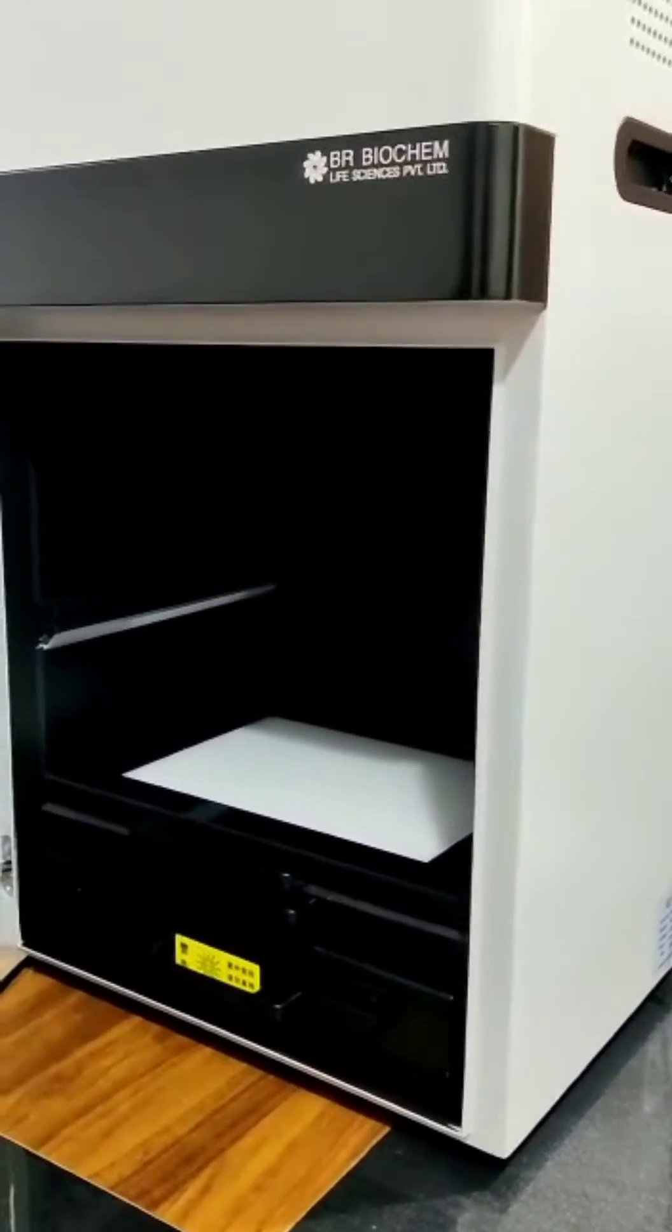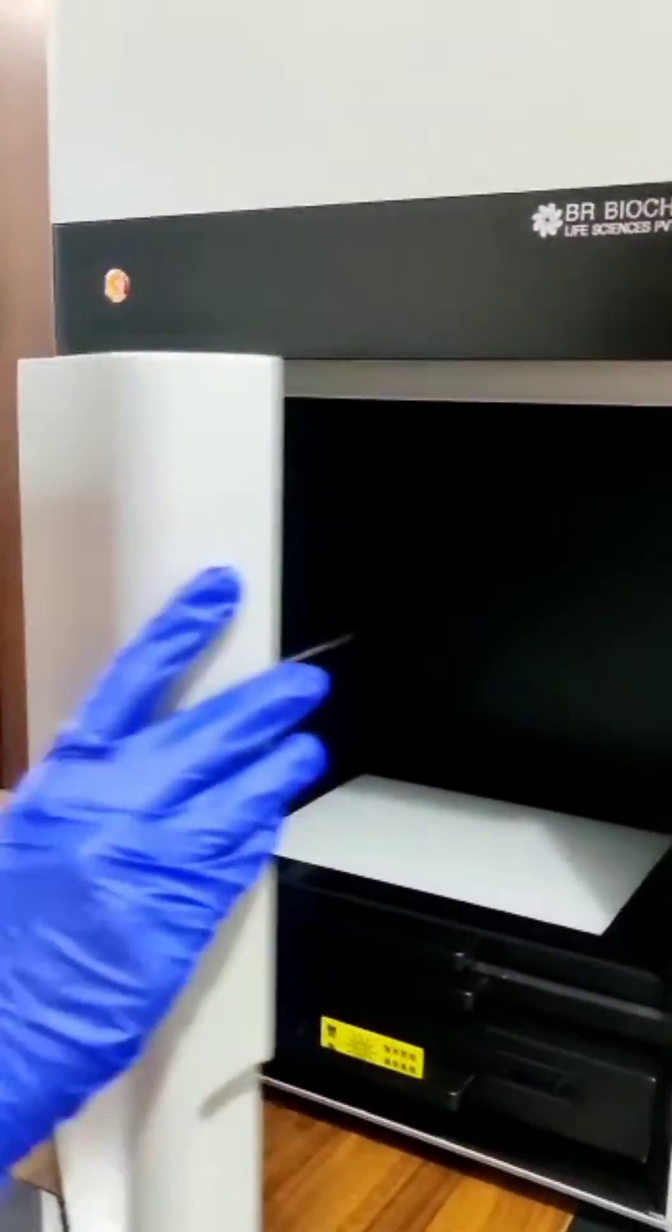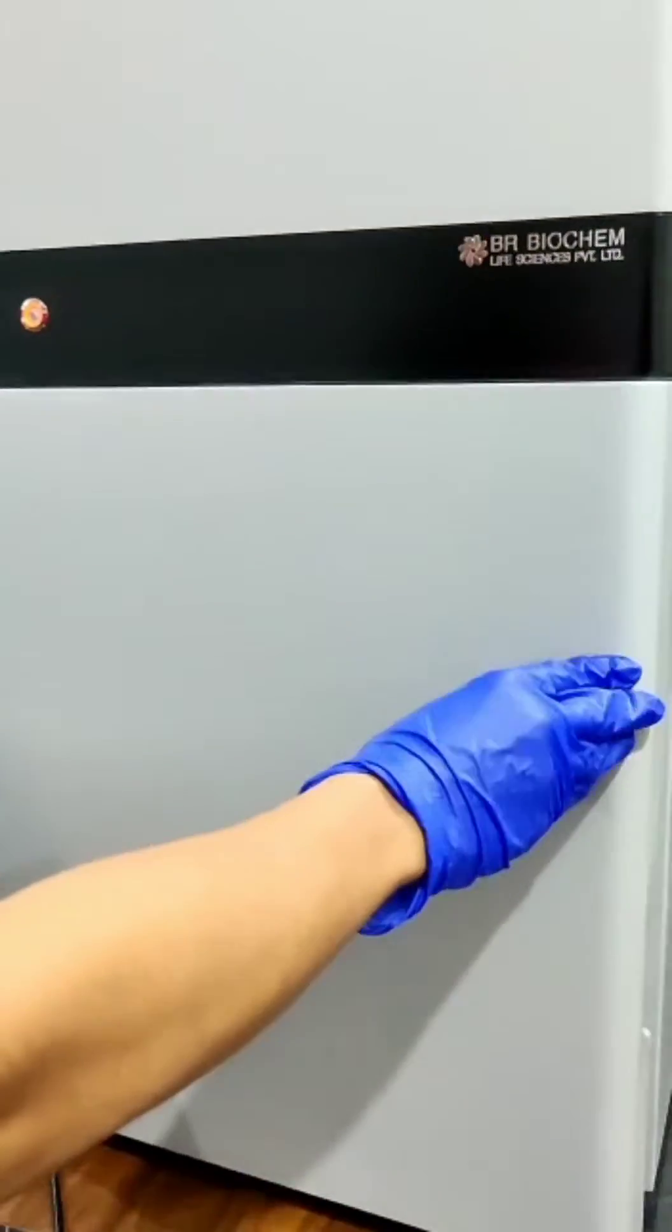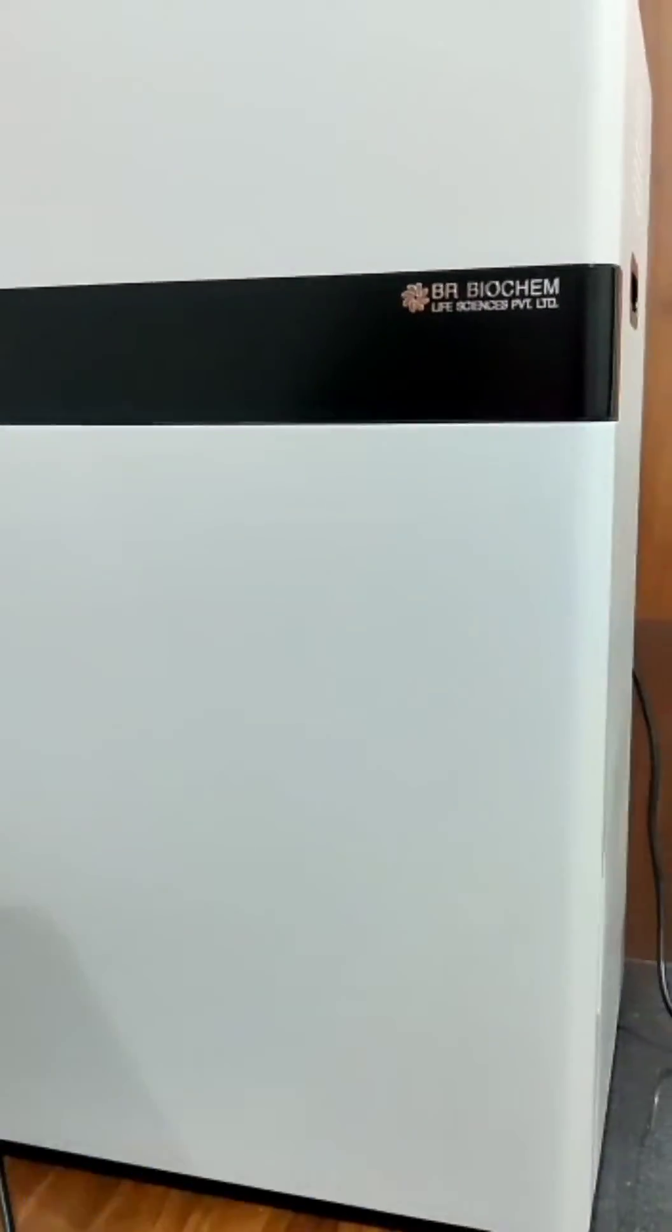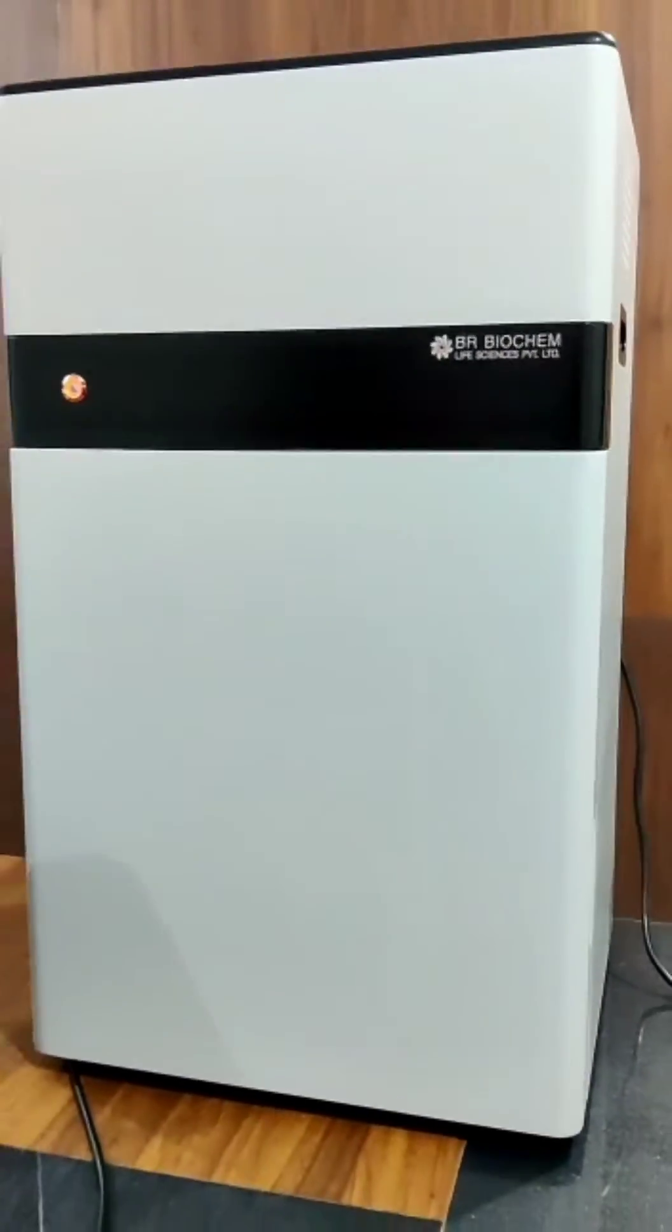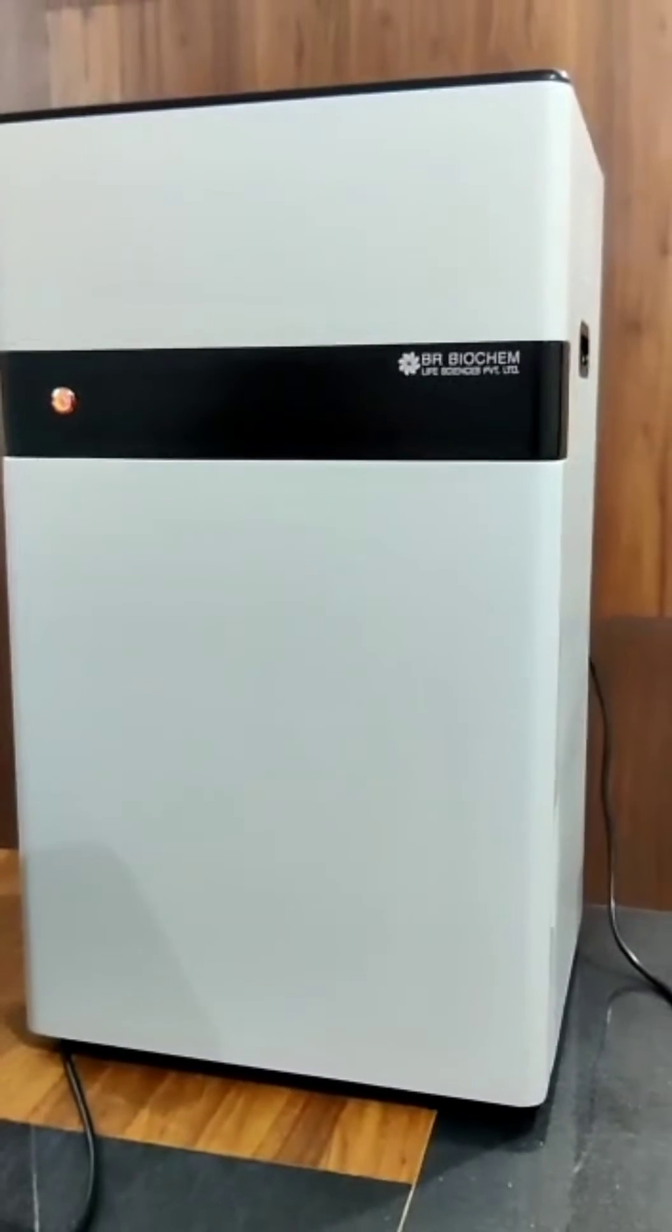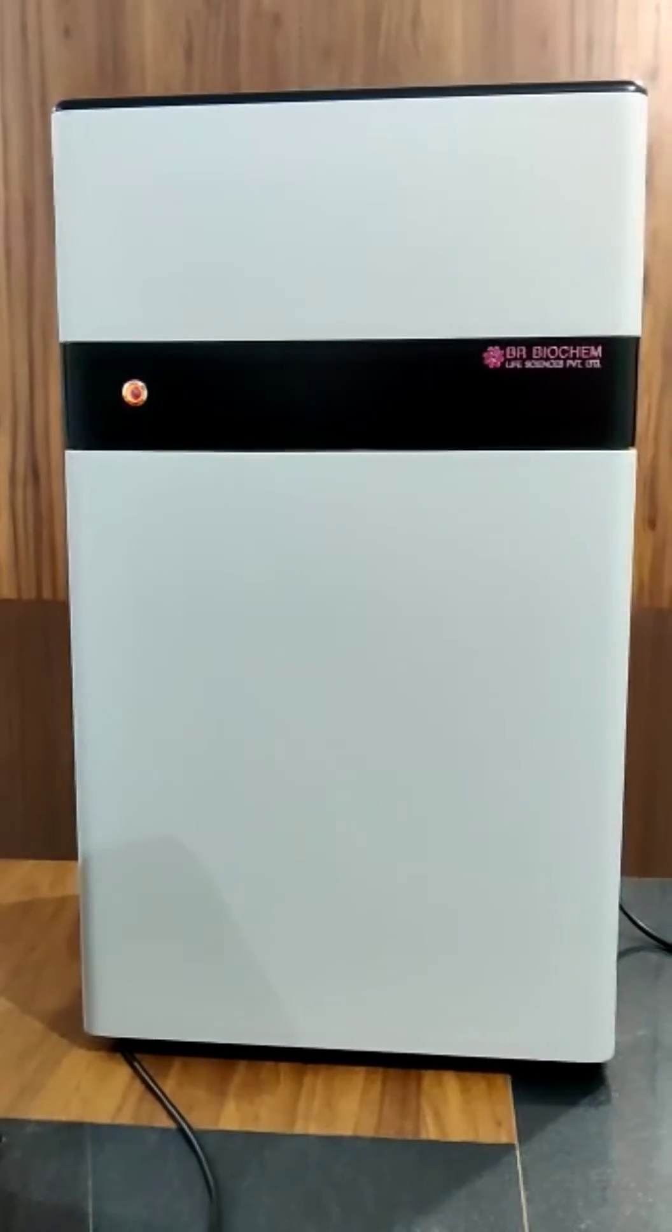We have another model of GEL Documentation also, with higher resolution of 20 megapixel CCD camera.